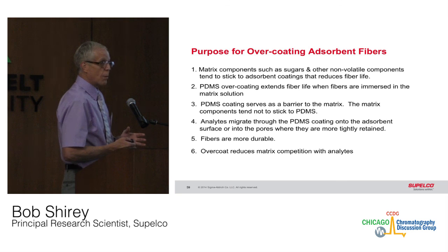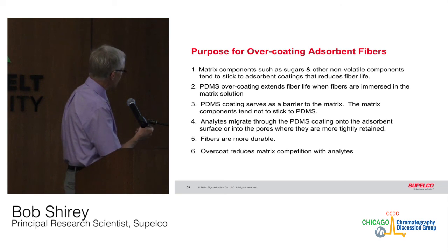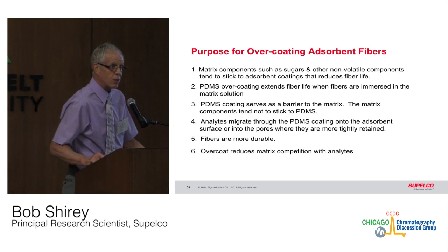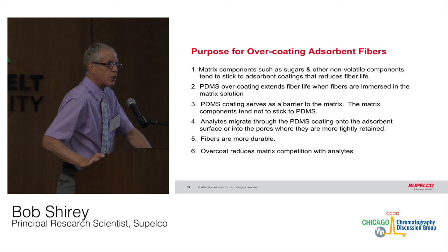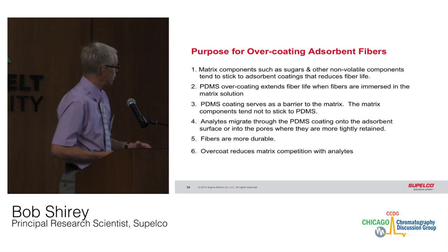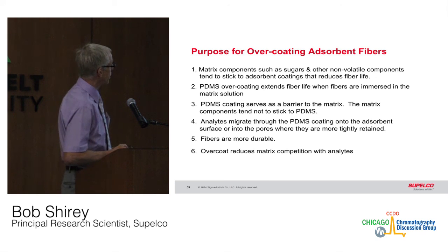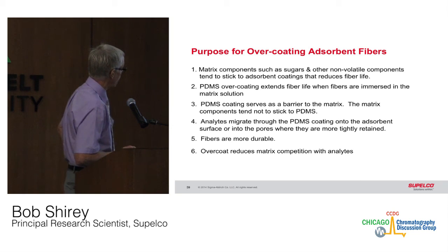Now I'd like to shift gears a little bit to some new products that we were using for SPME, and look at the overcoated fibers. We wanted to be able to use SPME in more complex matrices, primarily food matrices. Compounds such as sugars and other non-volatiles, dyes, tend to stick particularly to the adsorbent, the divinyl benzene component, which is going to be exposed at the surface. So we wanted to figure out how we can keep this matrix from binding so much with the fiber, and still allow the components of interest to pass through.